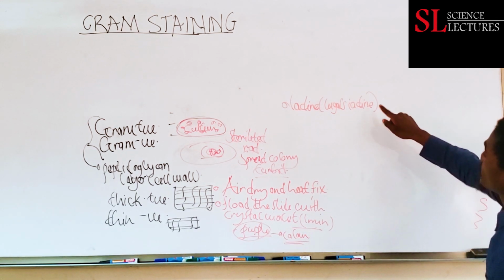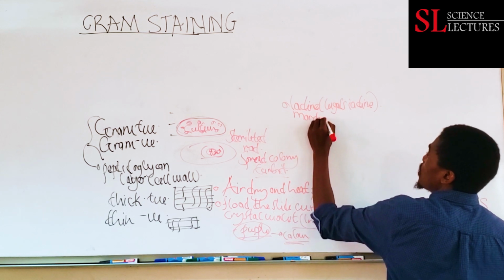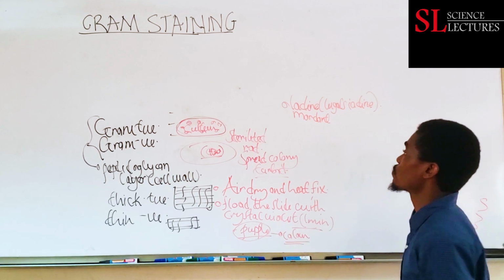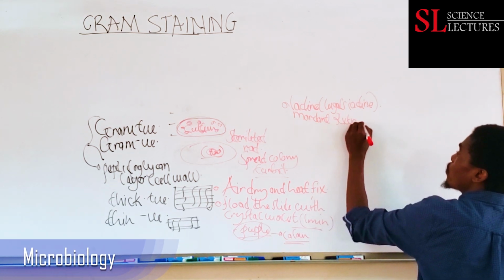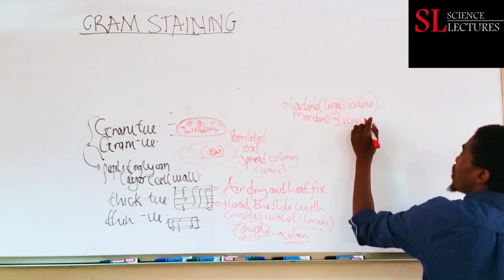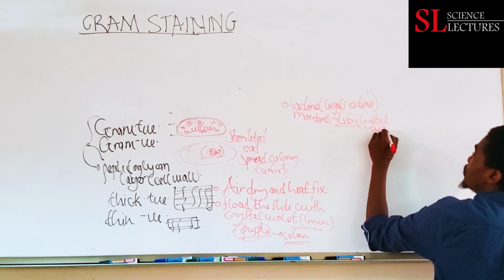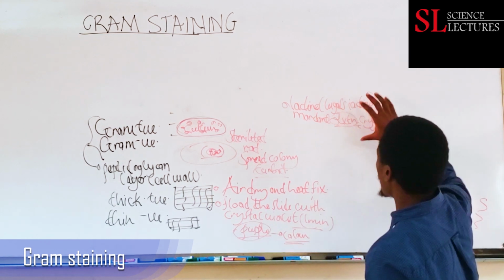Lugol's iodine works as a mordant, in that it will help to fix the crystal violet in position. It will have a chemical reaction with the crystal violet, so they react in conjunction with one another.